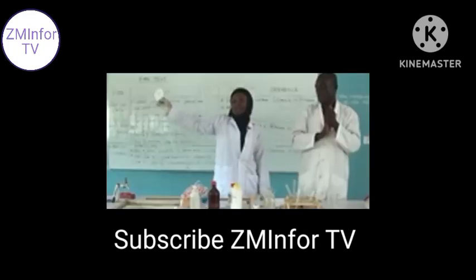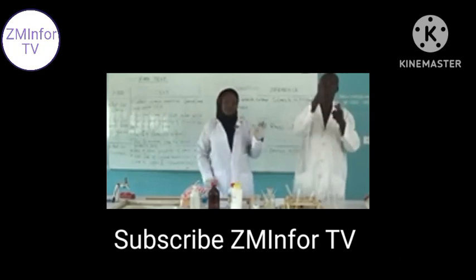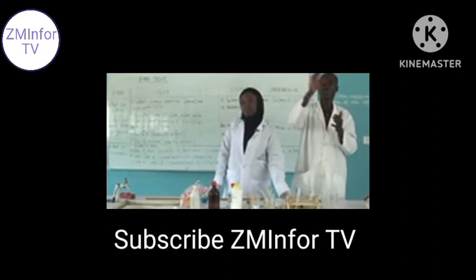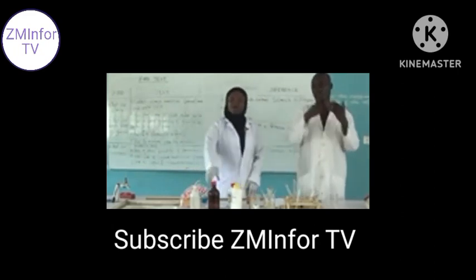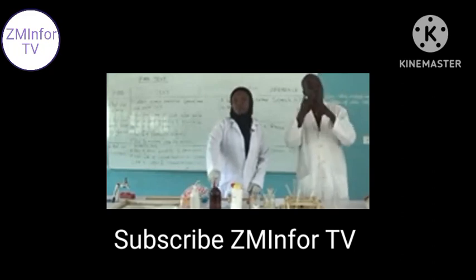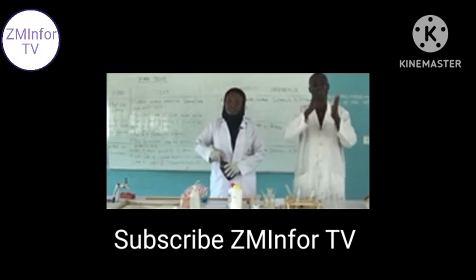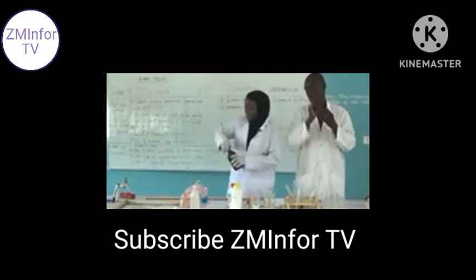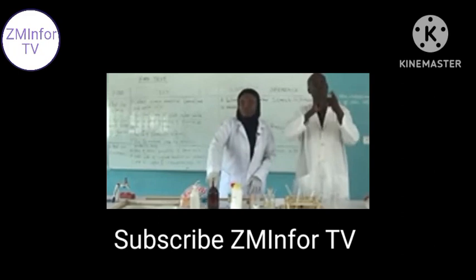Earlier, my colleague introduced you to those three major food parts: carbohydrates, proteins, fats and oils. We have gone through certain food substances in our houses, common ones, which show that these materials are present. We have run a simple test using starch material, bread, to see the presence of starch.